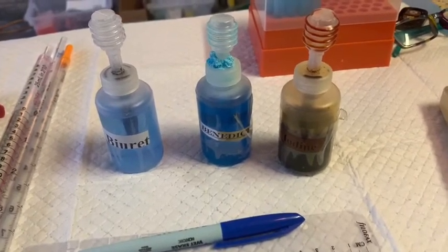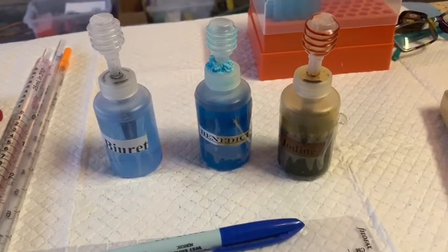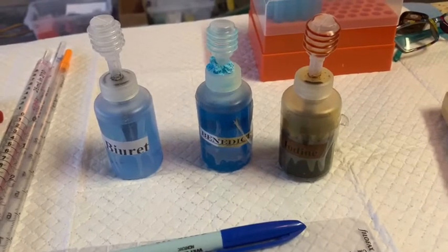We're also going to do a pretty quick and easy assay that will allow you to determine if there are fats within the food you are assaying.